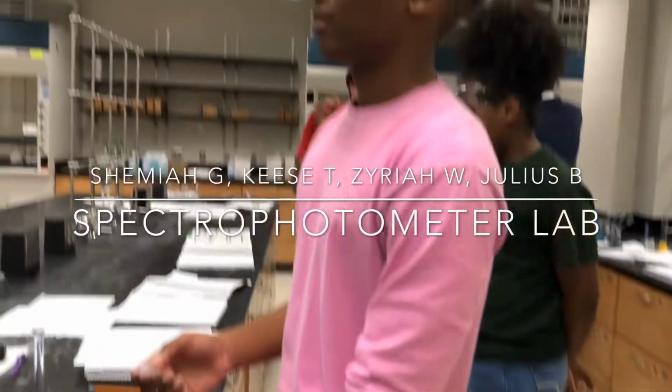Before starting the lab, make sure everyone has on the right attire, including their goggles.